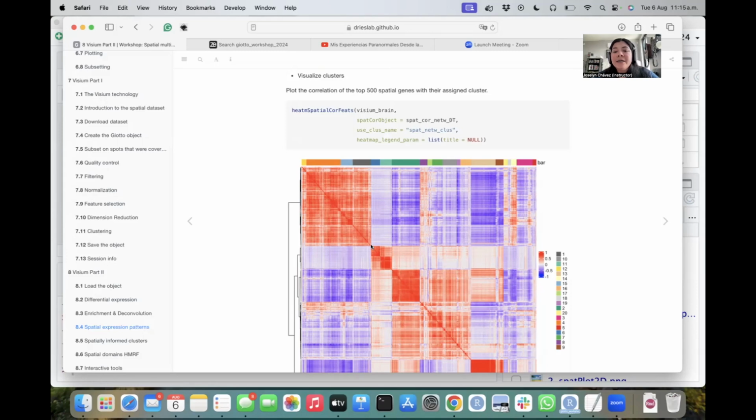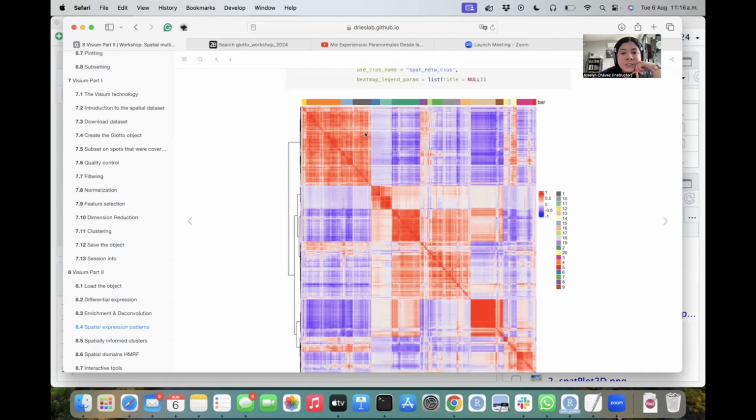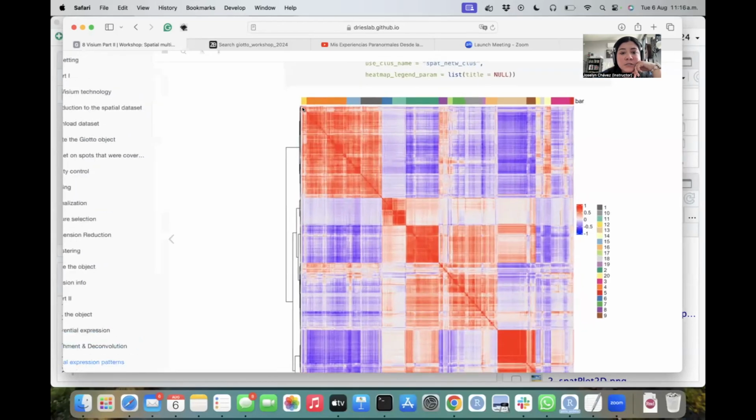Right now, I decided to cluster them into 20 clusters, but probably I could reduce the number. And if I reduce the number, instead of having these 4 clusters here, I will probably be able to merge them into one big cluster that is basically representing this big square. Right now, it separates them depending on small subclusters that we can observe, like here.